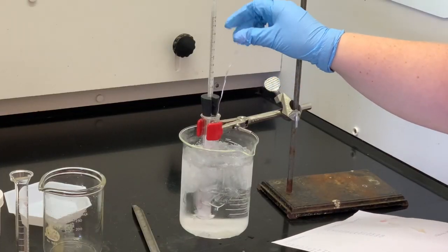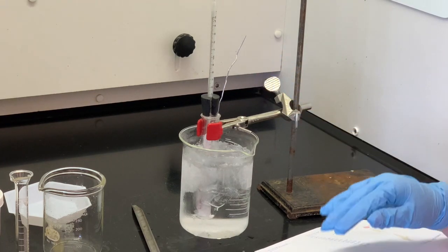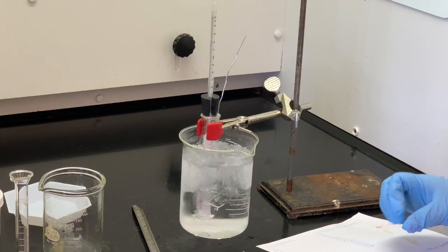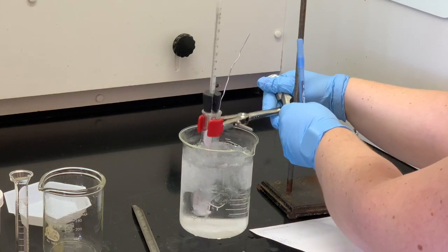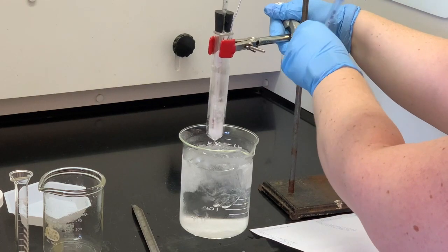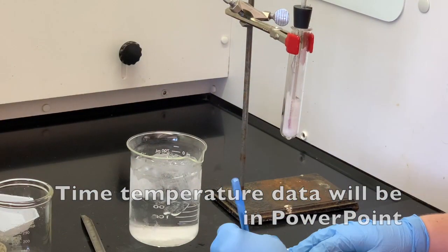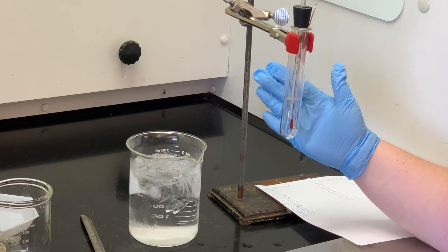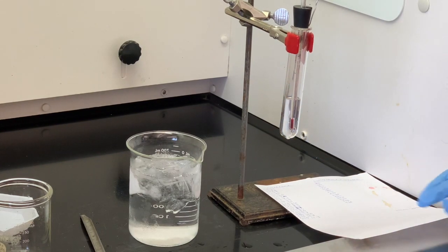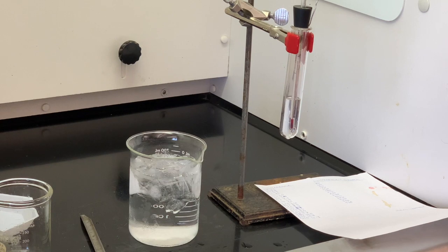Our solution has frozen, so I can't really move the stirrer anymore. I'm going to pull it up out of the ice bath and take the temperature every 30 seconds until the temperature gets to somewhere between 10 and 12 degrees, so that you have enough points to make your plot to find the freezing point. You can see that this cyclohexane was frozen and now it is all liquid again. It's come up to a temperature of about 11.3 degrees, so that finishes the procedure for Part A. You'll have to graph that information and find the experimental freezing point of your cyclohexane.